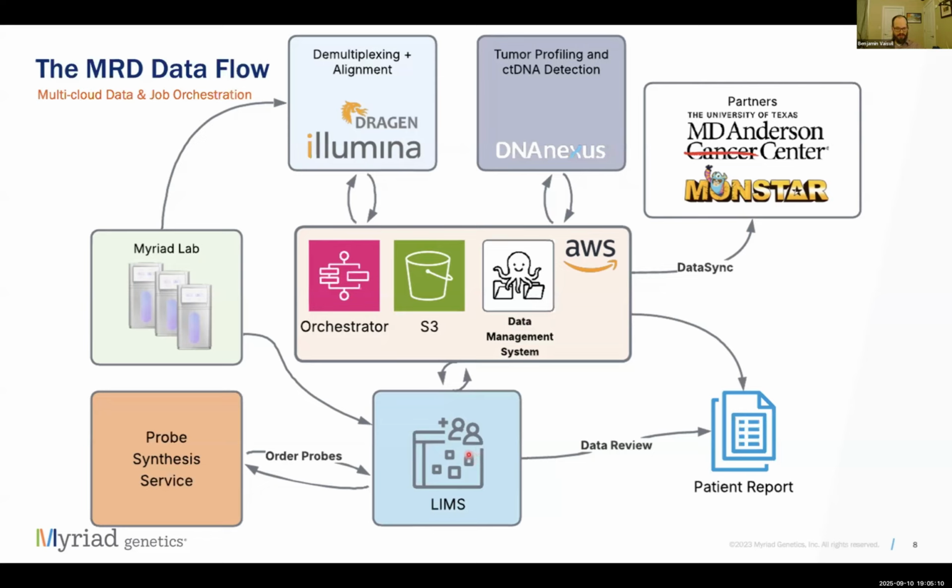Next, our orchestrator executes and monitors a DRAGEN alignment job, also on ICA, and this also updates the LIMS and DMS. Those results are then sent to the LIMS where somebody reviews them, and if they look good, and we have a buffy and tumor sample that pass review, we can then proceed to tumor profiling. Tumor profiling is initiated by the orchestrator by checking a queue in the LIMS.